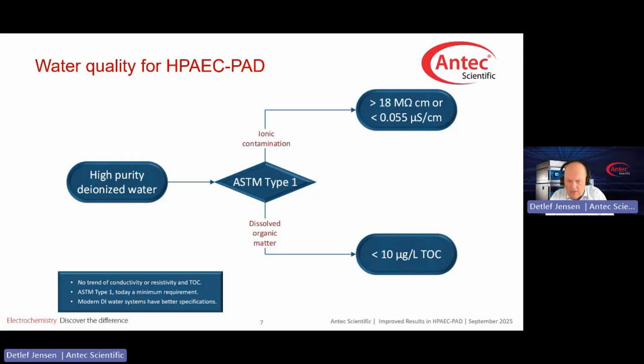There's only one crucial guideline. These numbers should not drift. If they do, it means your DI water system needs maintenance. Good water, you get it. So please keep an eye on your DI water system and consider DI water as a chemical. It really helps. Jare, why don't you take us through the next steps?